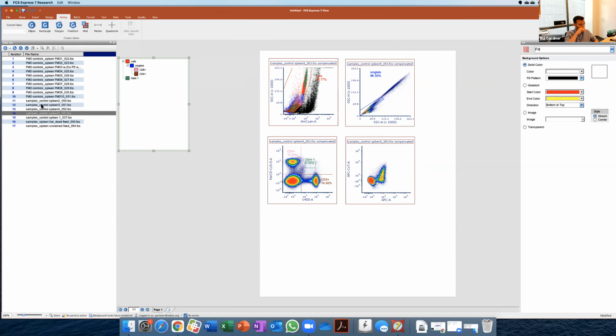We've discussed this in other circumstances, like the autofluorescence when you're doing unmixing, and without drifting away too much, it's one of those things that, well, if you gate just everything and you take into account the average levels, I mean, not really, because all your samples will be skewed, right, towards whatever. I mean, if most of the samples actually are the same and have the same levels of expression, maybe that will be okay. But if there's a huge variability, then no.